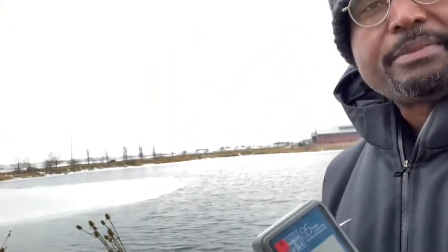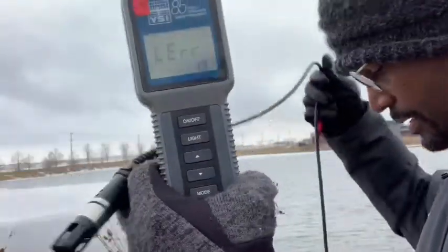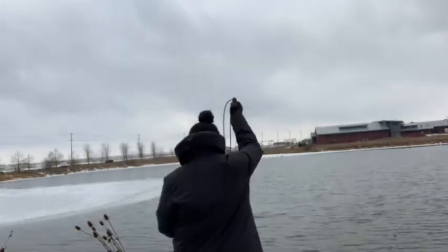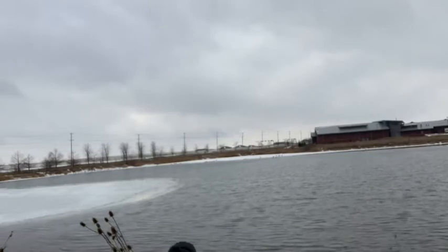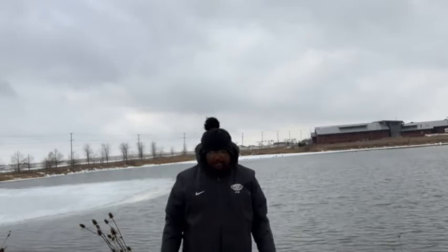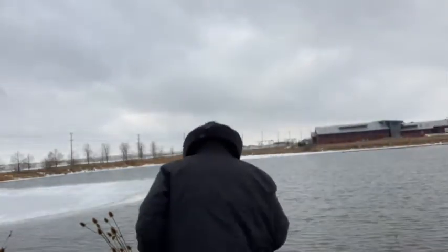So now I'm going to throw my probe into the lake. The temperature in that spot is 1.2 degrees Celsius.